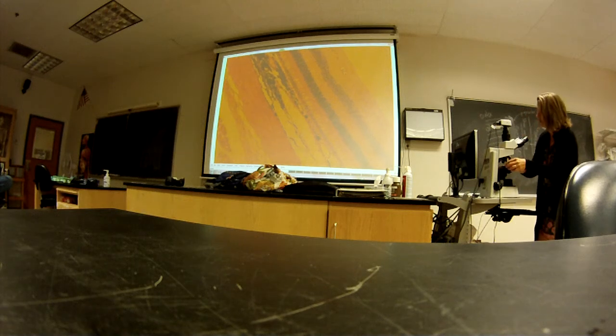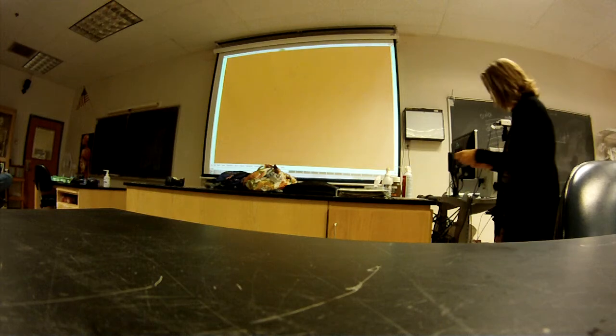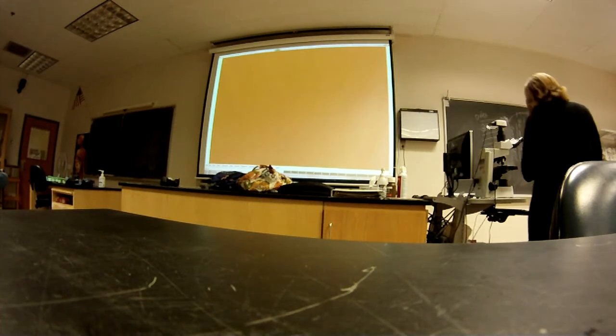Okay, so that's good with this slide. So now we need the one where we can see the whole eye. All right, this one's F23R, in case you want to reference your lab or look back at it later in the library or during class.